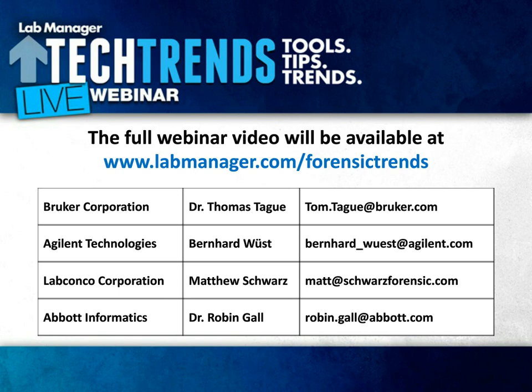Thank you. Now, Robin, are there any efforts to standardize instrument outputs to integrate with LIMS systems? Most instruments are fairly standard in the way that they output data. We can work with a lot of file types, and so I'm not aware of any actual efforts ongoing, but most LIMS vendors are able to work with the file types that are put out by the instruments on the market today. A lot of times interfaces are done using things like web services and API and so forth.